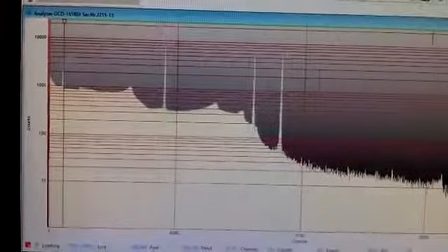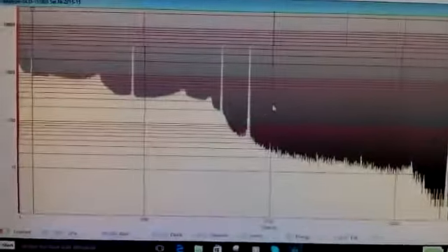So now I have manually inserted a region of interest around one particular peak which was missed in my initial peak search. I think the reason I missed it is because I don't have enough statistics in here, and the peak has only 479 counts, but I think this is my cadmium 109 peak. So double click, go back here. So actually I have now located my cadmium peak, cesium peak, and two cobalt peaks. I have 4 peaks, and I'm going to use these 4 peaks to conduct an energy calibration.